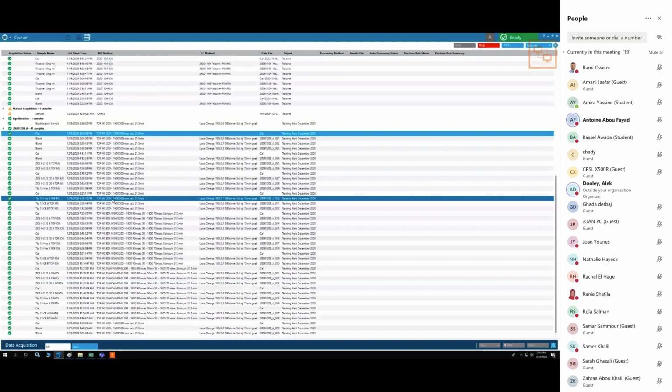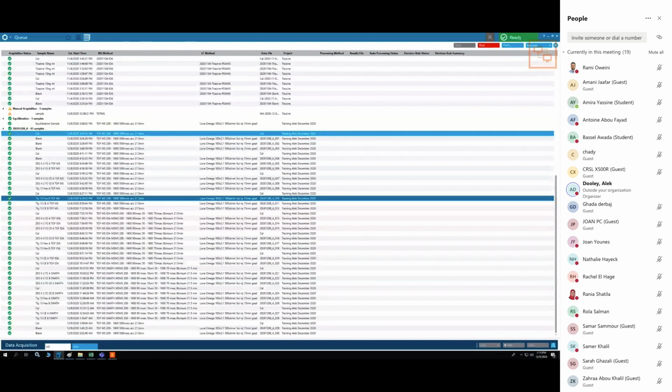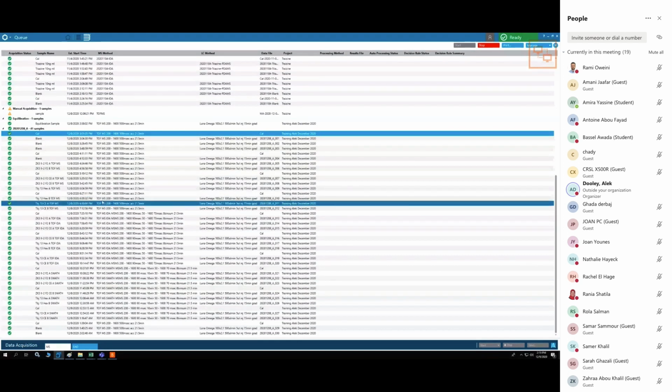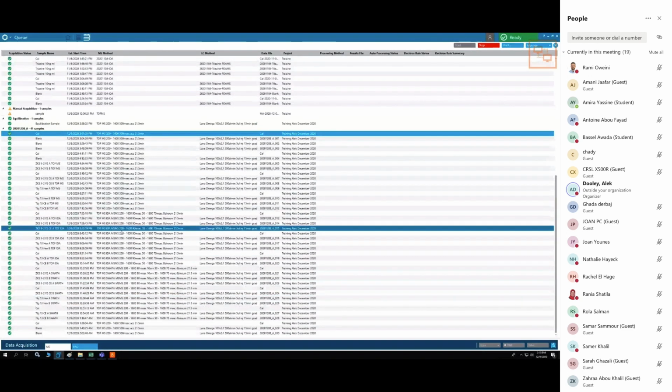All right. So any further questions on batch or queue? And don't forget, batch and queue is definitely a video in SCIEX OS. So if you do need a refresher, if you go on Christmas break or whatever and come back, those videos are there.